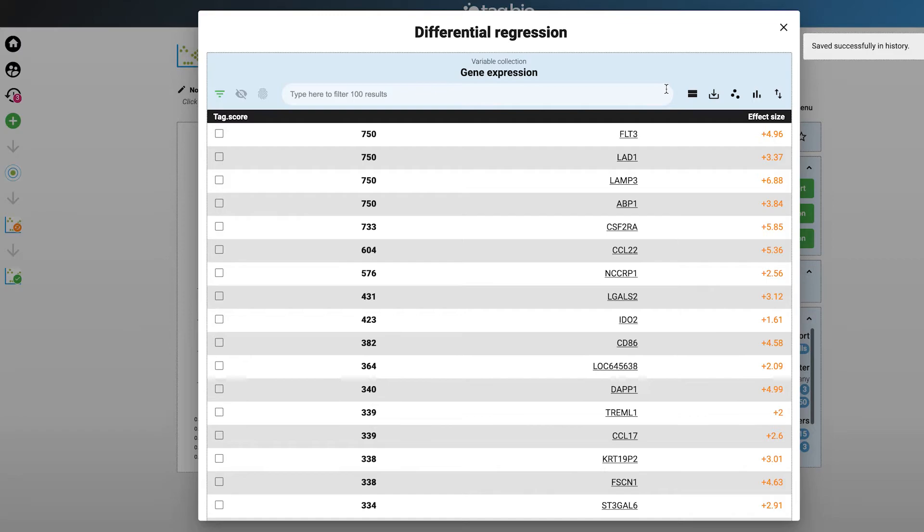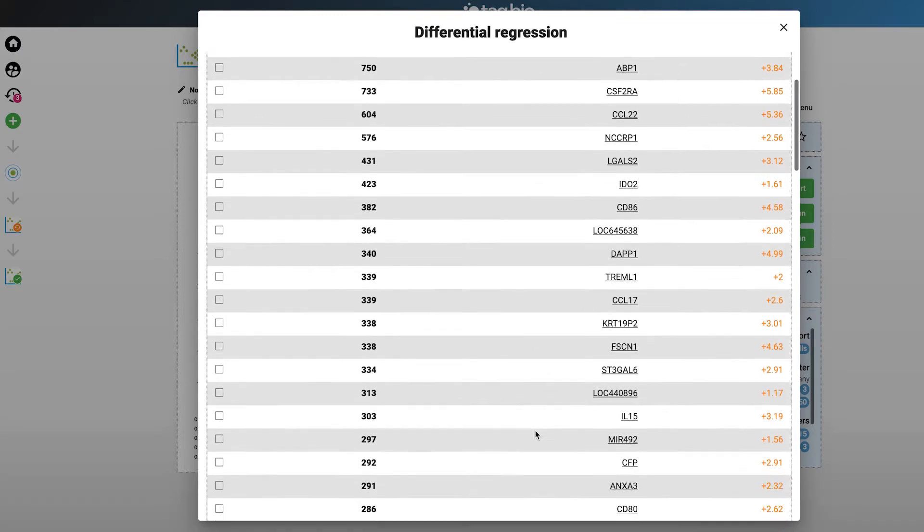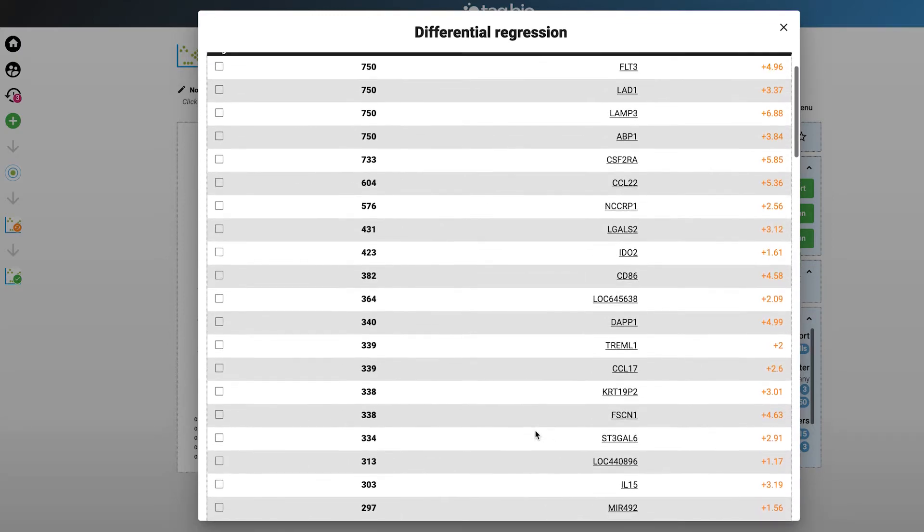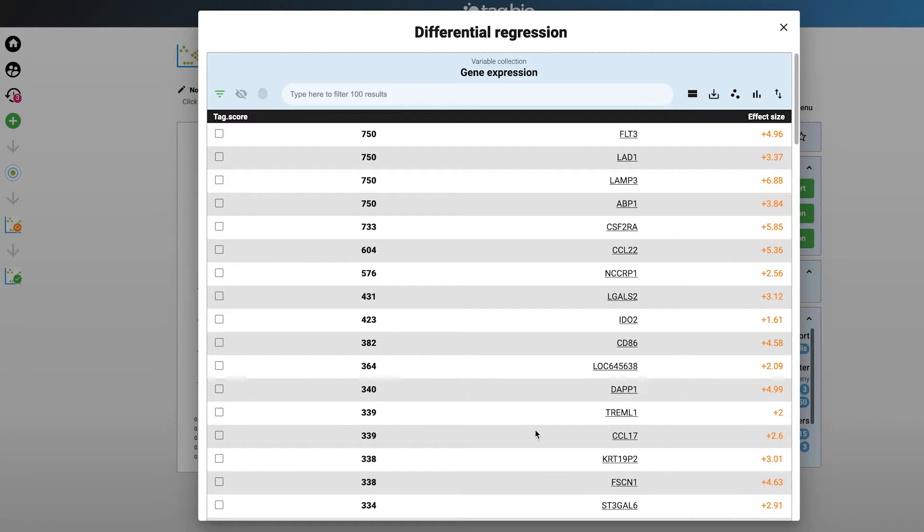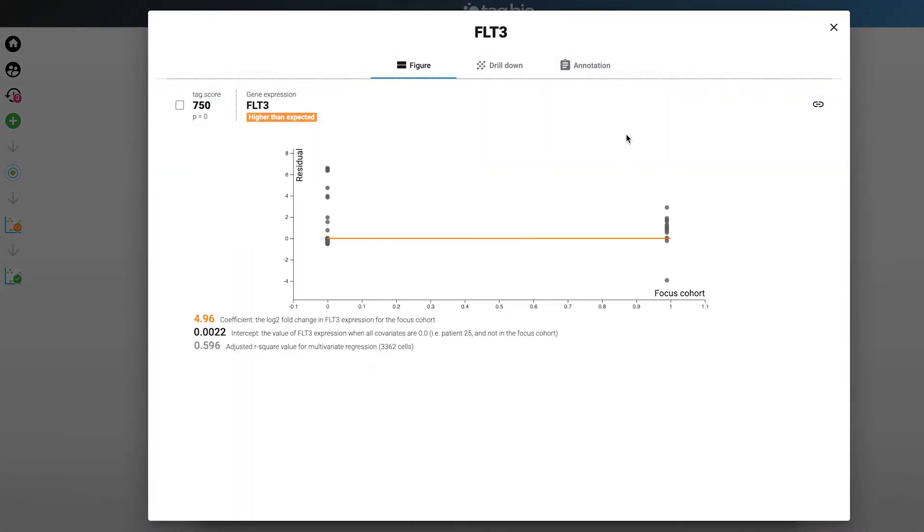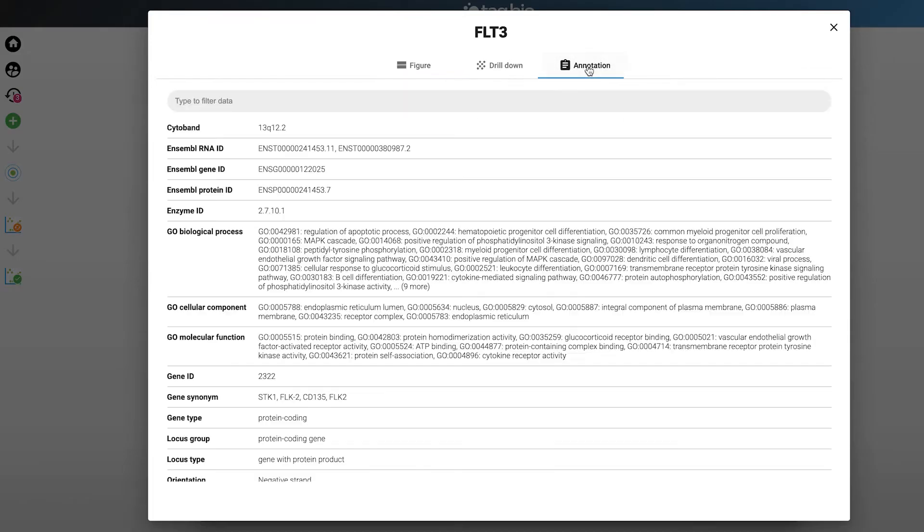The genes you see organized in this list by their tag score are characteristic of dendritic cells. If you want to know more details about any gene, say this one, you can click on it for more information. Then go to the annotation tab to get more details about its function.